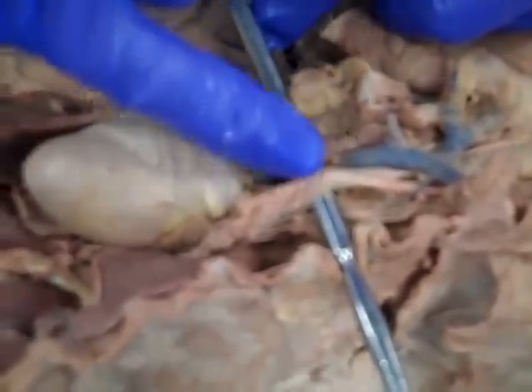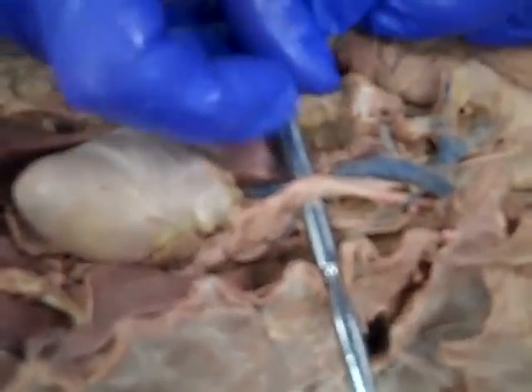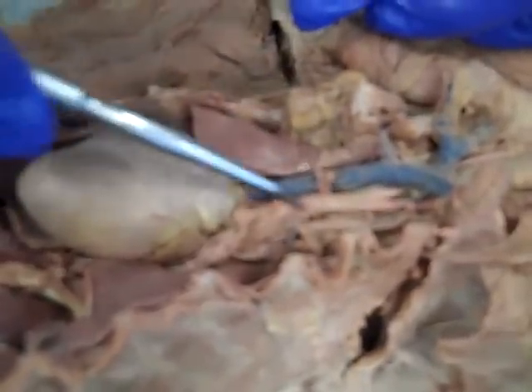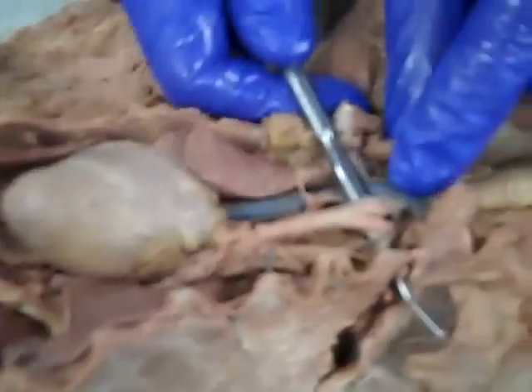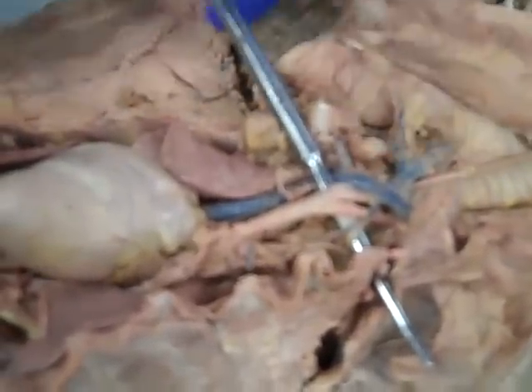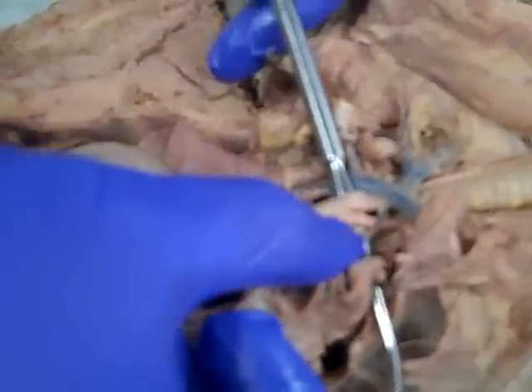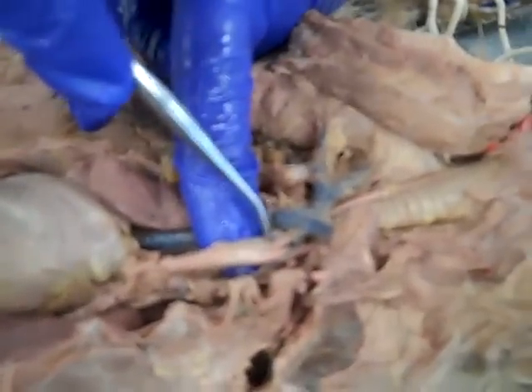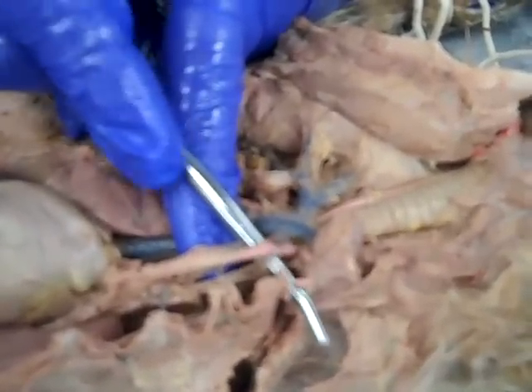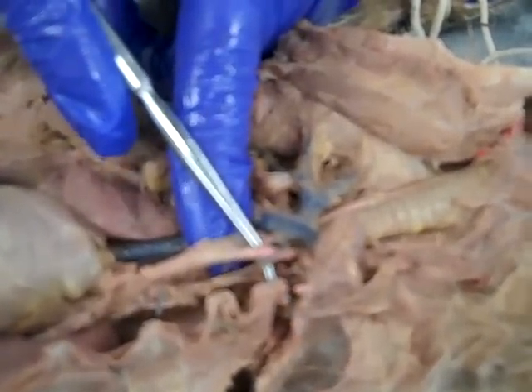Now, a cat has two branches off its aortic arch, whereas a human like me is going to have three. In a human, in between the brachiocephalic and the left subclavian, we're going to find a left common carotid. But we don't see that here. The reason we don't see it here is because if we walk up on the brachiocephalic, the left common carotid is right there. So this first branch right here, the one that's leftmost, is the left common carotid.